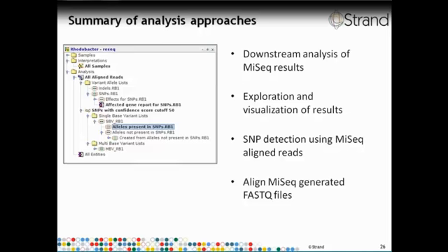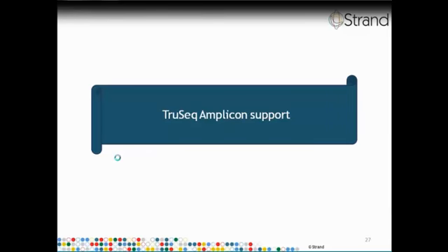After that, when you're prompted, we click on the MiSeq button and choose the Amplicon folder. In this case, 3 different alignments have been carried out with the FASTQ files in the Amplicon directory. We can choose the appropriate alignment folder, and then all the relevant aligned read files are automatically populated into the sample loader. You can see that even though the sample number is 1, it has consulted a sample naming sheet and found out that the appropriate name of the sample is NA18502. One can scroll down this list and verify that the correct sample names have been assigned to these files.